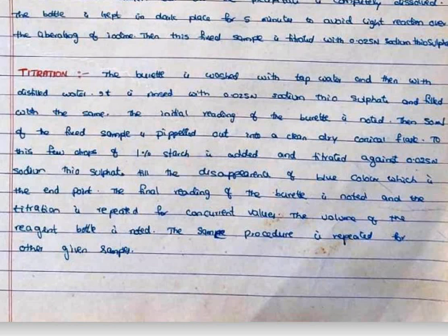It is rinsed with 0.025 N sodium thiosulfate and filled with the same.